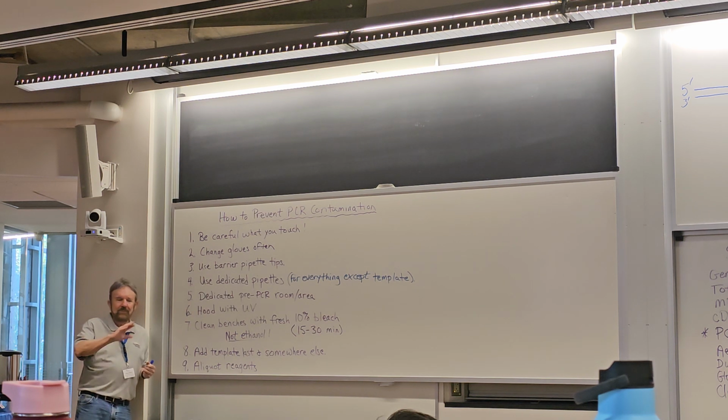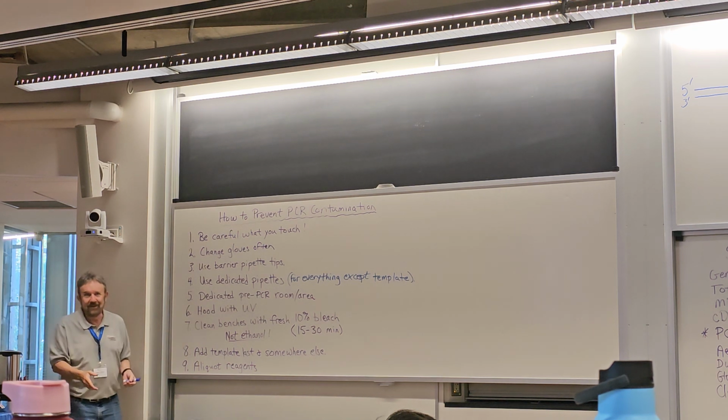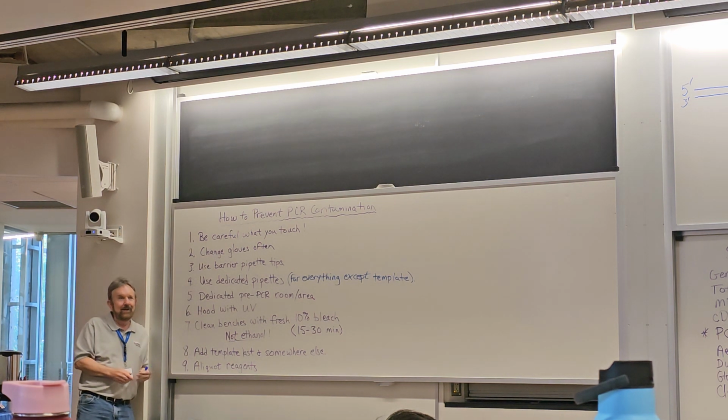Everybody else is okay. We detect the contamination in individual 1's reagents because we see that we have a negative control giving us a positive result. So the first thing we do is throw those reagents away. Now, if this was your main tube of polymerase that you just paid $250 for, you're throwing away $250 maybe on the same day you got it, right? Because somebody contaminated it. But if everybody's got their own little aliquot, then that person throws away their stuff and everybody else is fine, right?